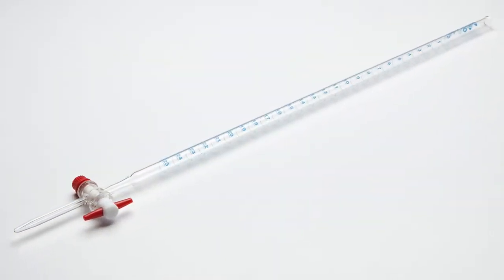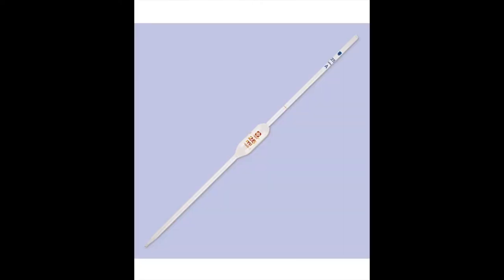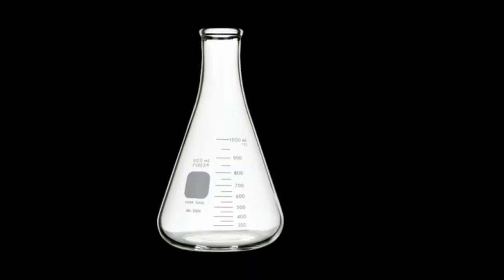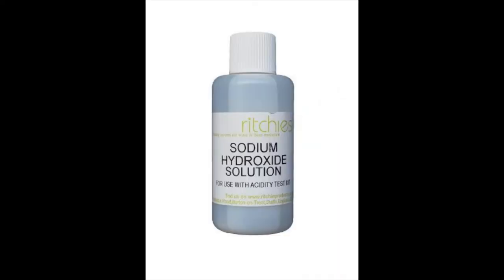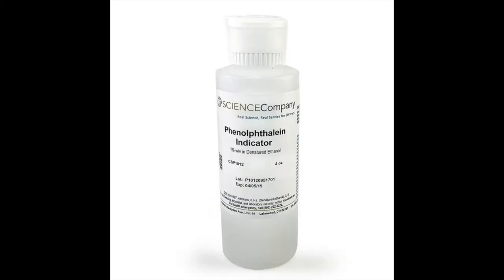Before we start, the equipment you'll need is a burette, a ring stand with a butterfly clamp attached to it, a volumetric pipette, a small funnel, an Erlenmeyer flask, a pipette, a bottle with a 1 molar solution of sodium hydroxide, 10 milliliters of hydrochloric acid, and the indicator, which is a bottle of phenolphthalein.